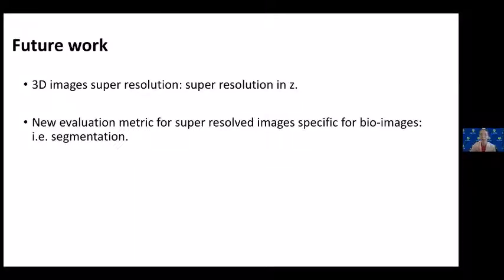That's exactly what we thought about, and I'm glad you mentioned it. We had some thoughts about, like you said, the final task. A lot of biologists want to segment a specific structure, so we can evaluate based on the segmented results, like whether the segmented structure's volume, or the amount of segmented signal, or how many segmented structures there are, match those of the high resolution images. But when we go to individual cases, there can be a lot of different ways we can do that, because there are a lot of different tasks. I think that's a great point, and we definitely have it on our radar as one of the next things we need to do. It's also a lot of effort, because you have to get actual cases to evaluate, right?